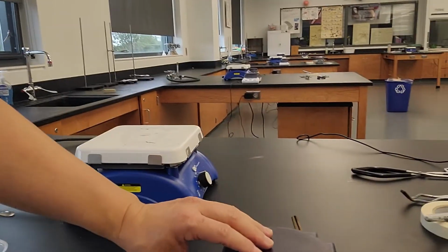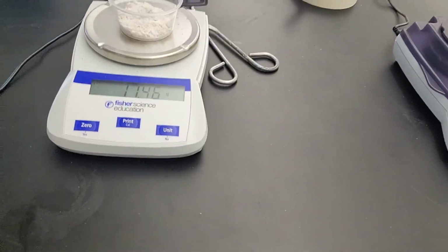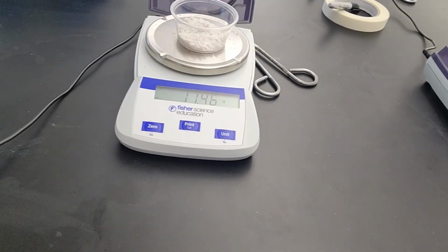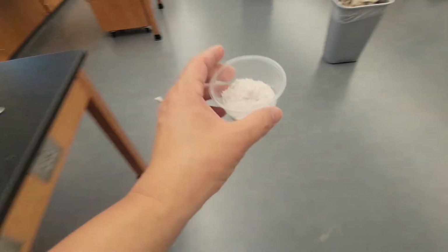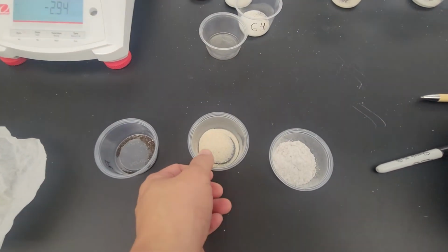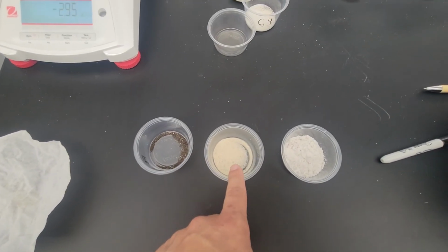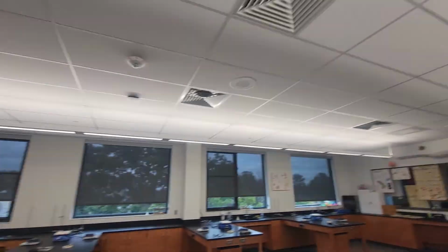So let's weigh this. It's already zeroed. 11.46. So we've separated the iron from the sand from the salt. Let's see how we did.